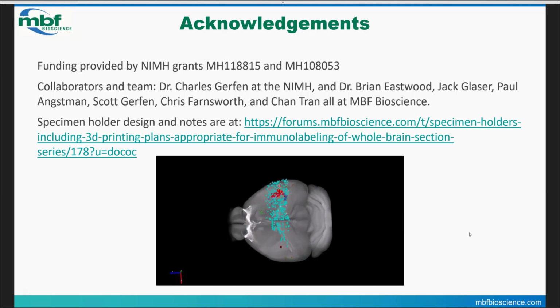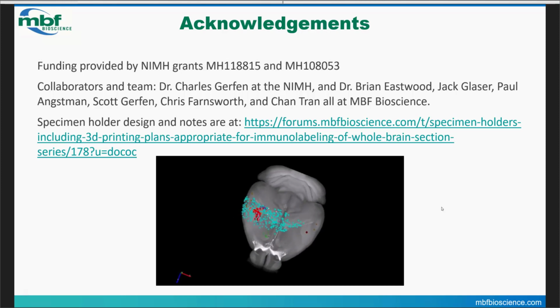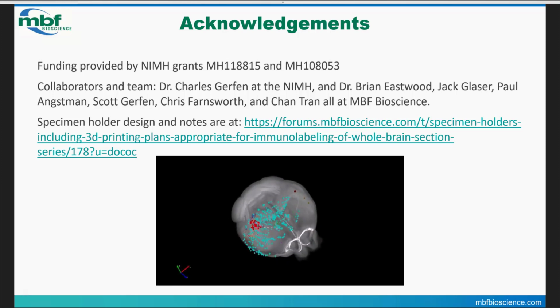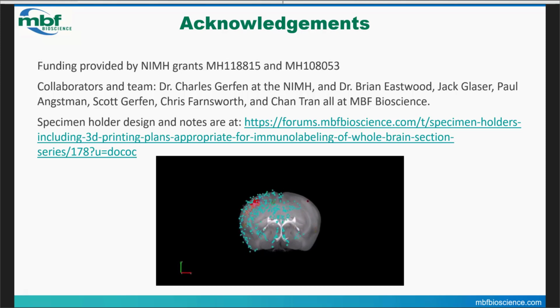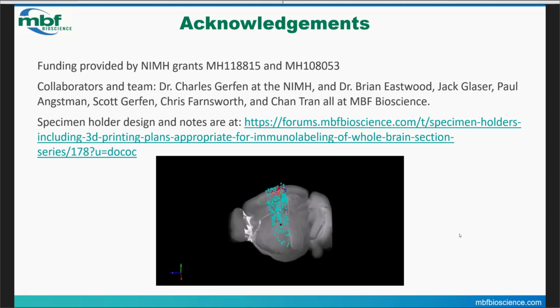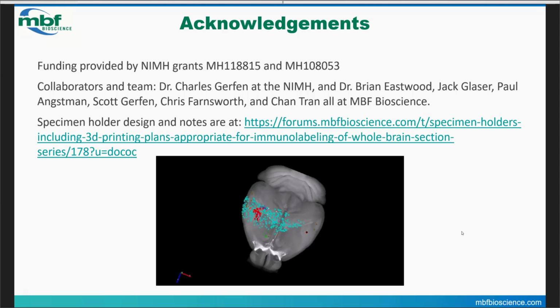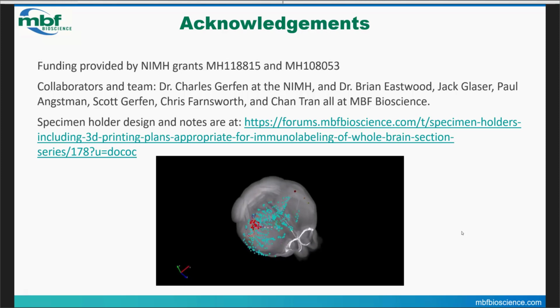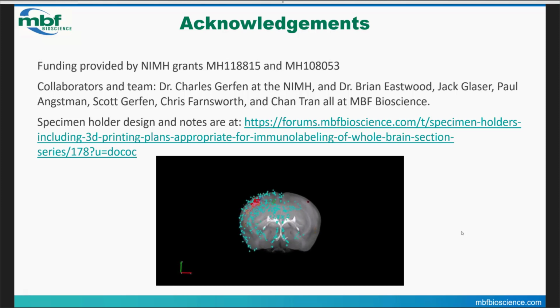We've been asked a few times, do these have to be confocal images? And these actually aren't confocal images. They're from a wide field epifluorescent Zeiss microscope at 10x. I'll just reiterate that because we've had a bunch of questions on that. These are definitely all from an epifluorescent wide field Zeiss microscope or Olympus or whatever type of microscope. But we've also used slide scanners like the Zeiss Axioscan and those formats for doing the imaging.